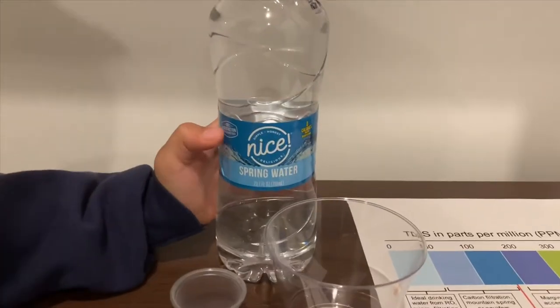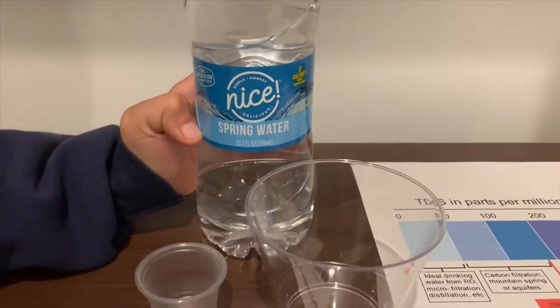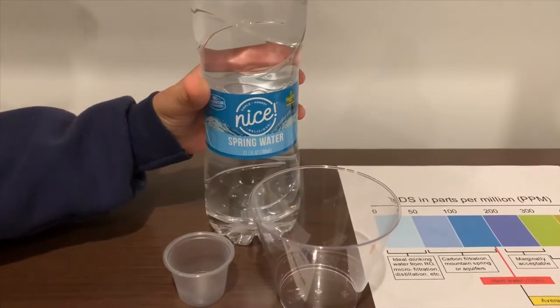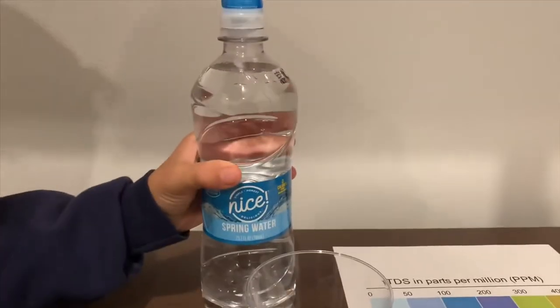This is a nice spring water. It is sourced from Sugar Pine Spring, California. It costs $1.19. Let's test the pH and TDS level.